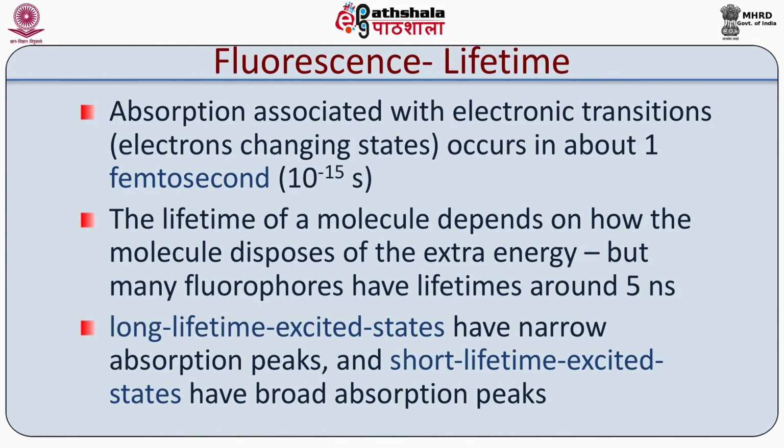So, shown as the lifetime of a fluorescent process, the absorption associated with the electronic transitions is about 1 femtosecond, and most fluorophores have a lifetime of around 5 nanoseconds. A long lifetime reflects a narrow absorption peak, and short-lifetime excited states have a broad absorption peak.